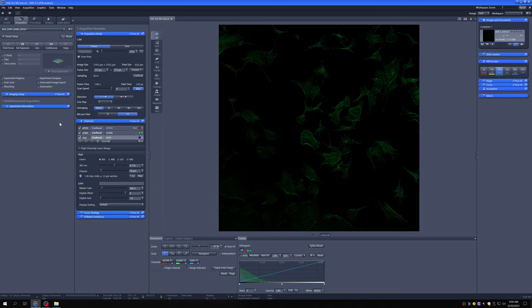The pinhole is what rejects out-of-focus light. If you make it too big, you get a lot of light, but you don't get good optical sectioning. You'll see a lot of blurry stuff. If it's too small, you get great optical sectioning, but at a certain point, you get so little light that you can't do anything useful with it.